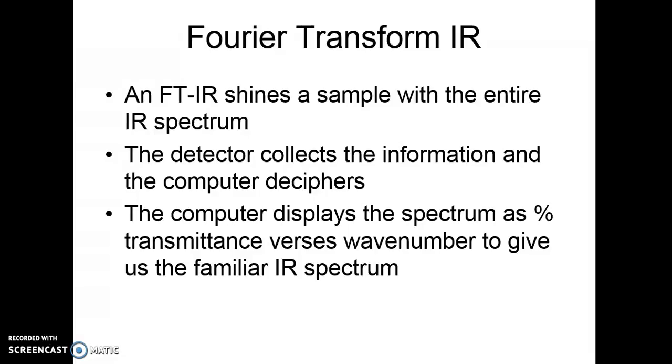Why? Because wavelengths tend to be very small numbers. Wave numbers are larger numbers. So it's much easier to deal with those numbers. I guess that's why they did it. It wouldn't bother me to have the tiny, tiny numbers with exponents on them, but someone must have thought that it was simpler. So you're going to see the wave number instead.